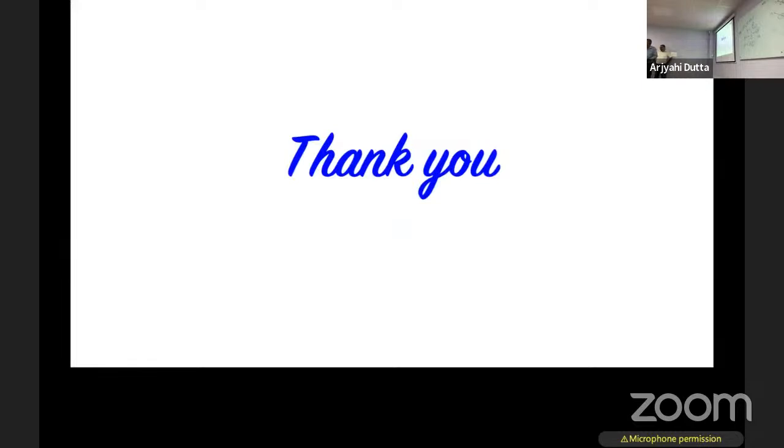If anyone has any question, they can ask. Let's say we want to see what is going on with respect to time, like live imaging. Here we are freezing the sample, so we are not able to see what is changing with respect to time.